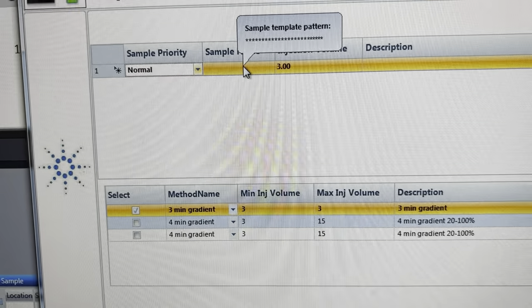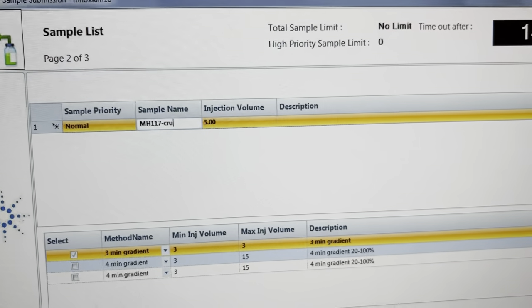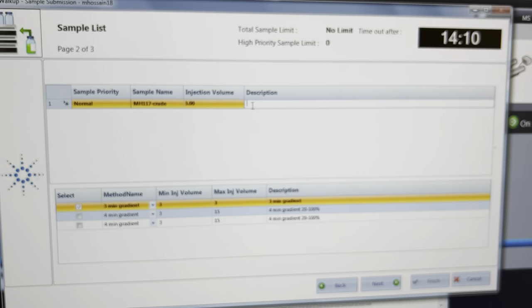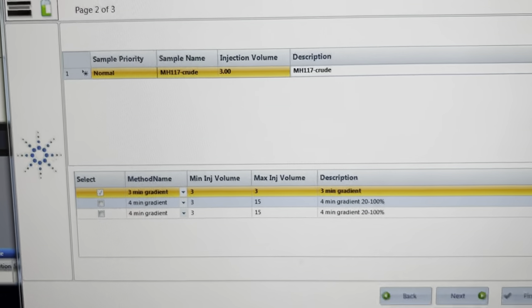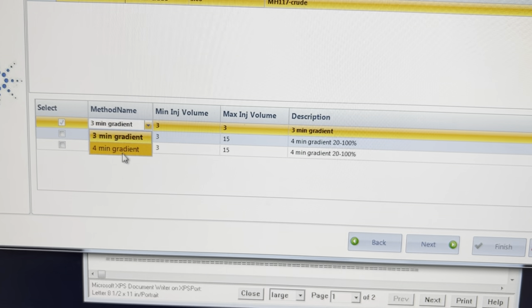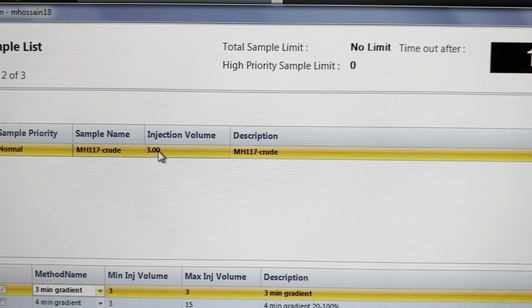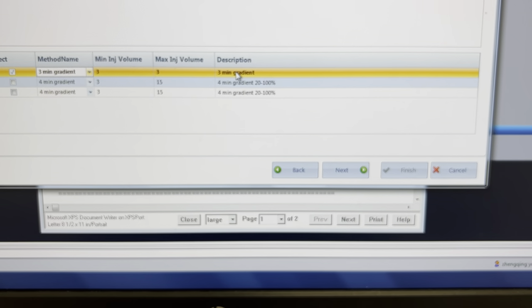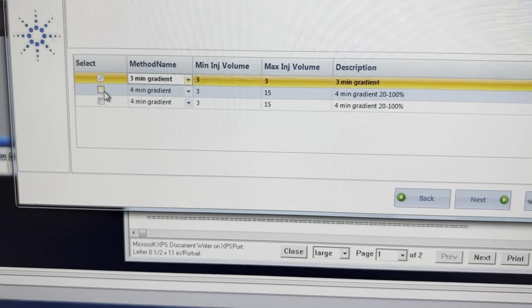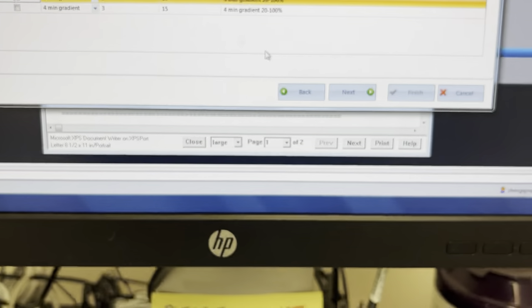After getting separated, it goes to the electrospray ionization system which generates ions detected by mass spectroscopy, visible in the computer. To submit a sample, there is a window where you enter your username, password, group ID, and number of samples. Once you submit that information, another window appears asking for the gradient you want to use, sample name, and injection volume. Here I'm putting in all the information — sample name, sample priority is normal, and injection volume. There are pre-made gradient modes: a three-minute gradient and a four-minute gradient, with injection volume of three microliters.